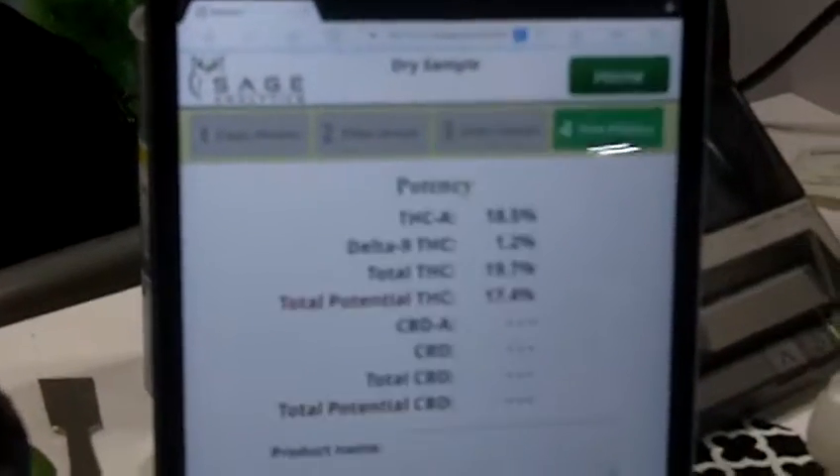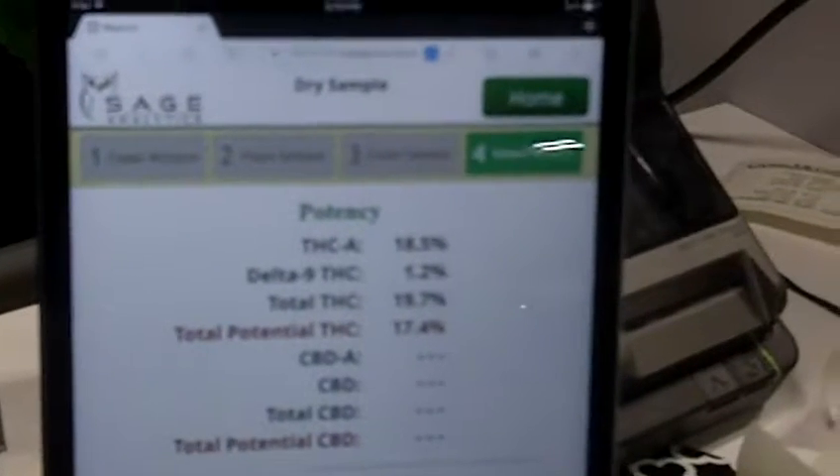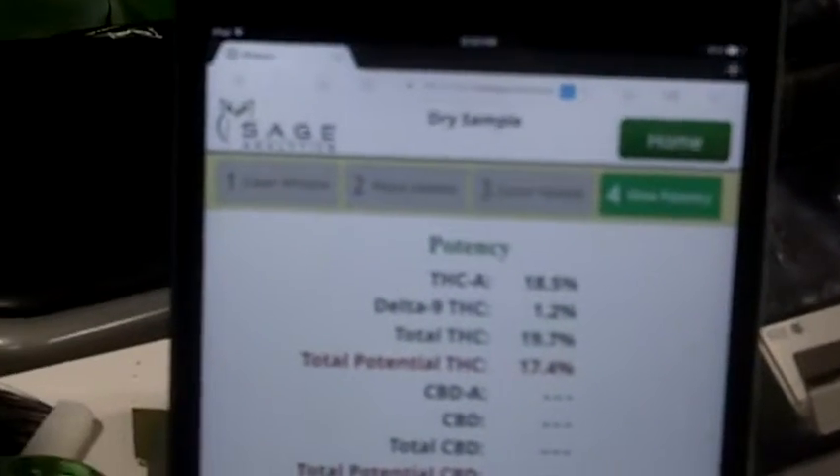It's calculating. Wow! So who would be the primary users of this? We sell to cultivators, dispensary owners, labs, and extract producers — anybody who is producing or selling product to dispensaries.